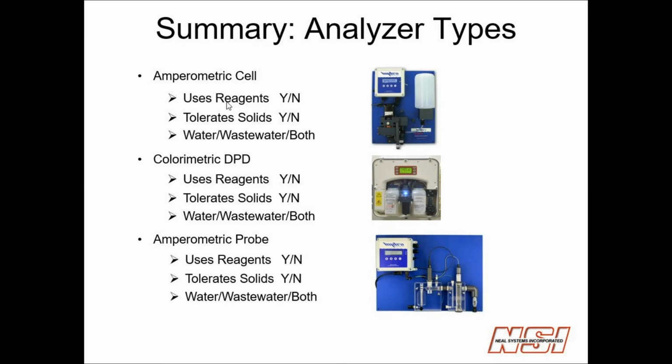So the Amperometric Cell type analyzer, if you said yes, it does use reagents, and this bottle needs to be replaced once a week. Does it tolerate solids? Yes, it does. The Amperometric Cell analyzer, and yes, it is good for both water and wastewater.